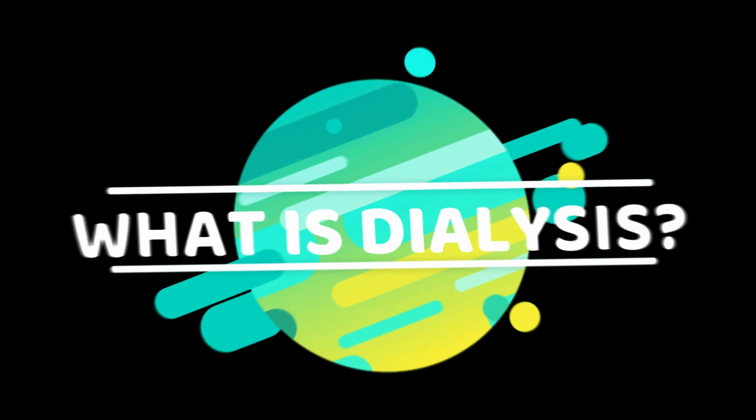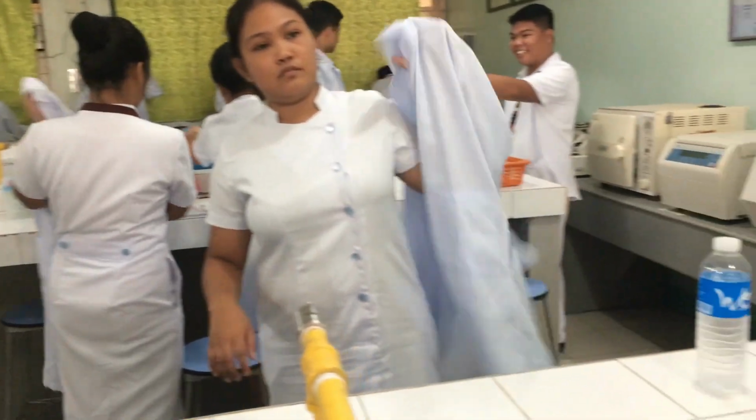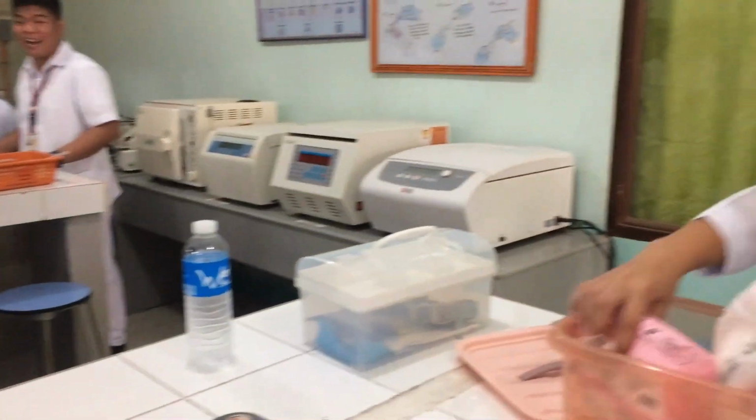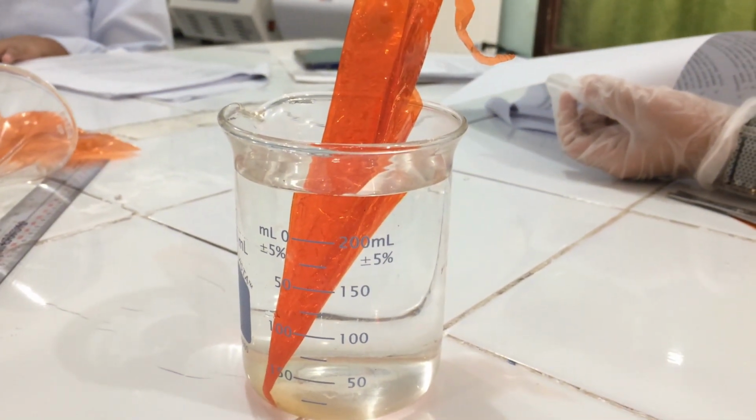Let us simulate dialysis that is being used by the cells, and afterwards, let us test for the presence of proteins and any other large molecules. In this case, let us use milk as the sample. Let us start by soaking 1 square foot of cellophane in water for a few minutes. Afterwards, fold it like a filter paper and fit it in a glass funnel. Now, pour 50 ml of milk in it.